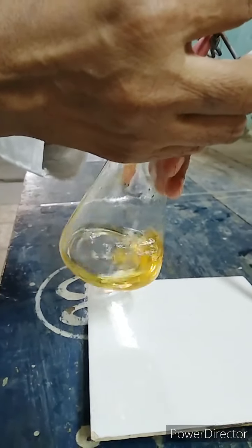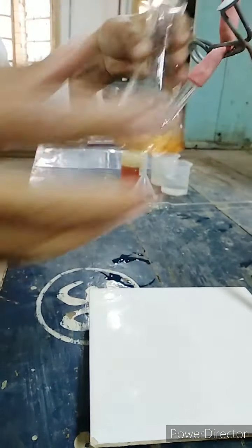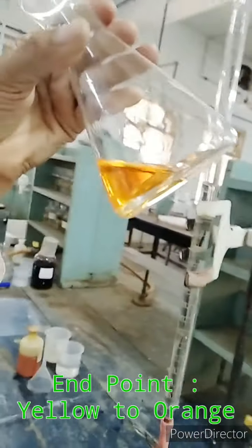You will notice a slight temporary appearance of orange color at the bottom of the flask. This is your final permanent orange color.